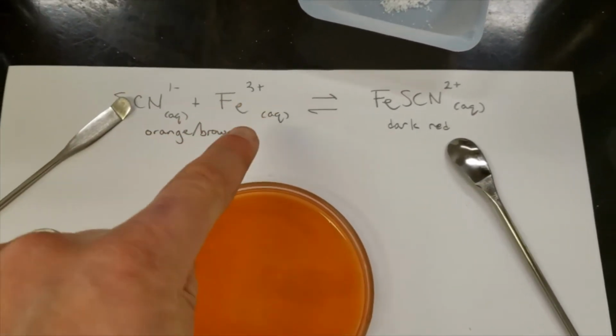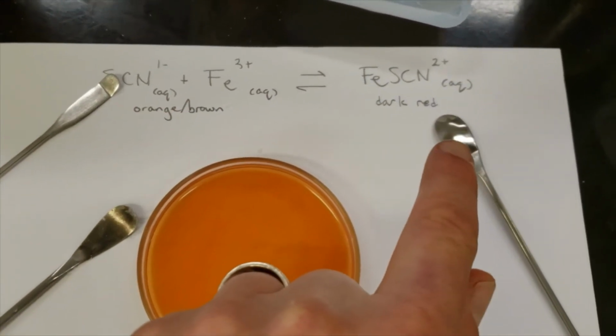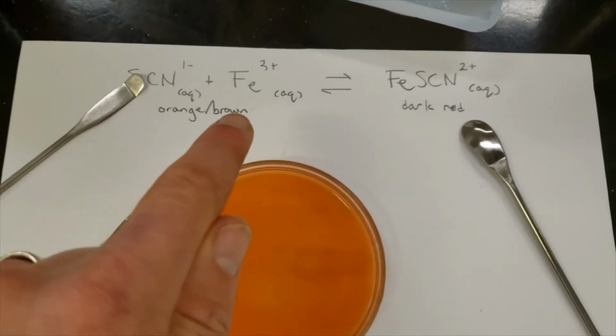So by decreasing the concentration of the iron 3 ion, the equilibrium shifts to the left and I produce more of the iron 3 ion.